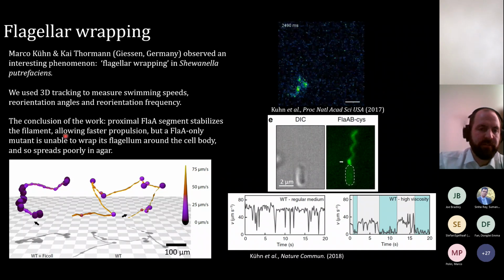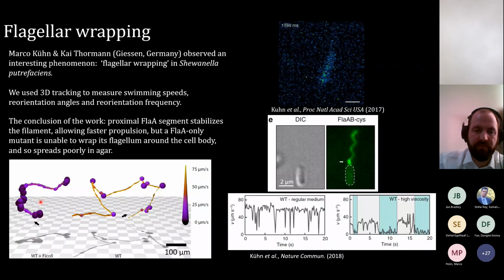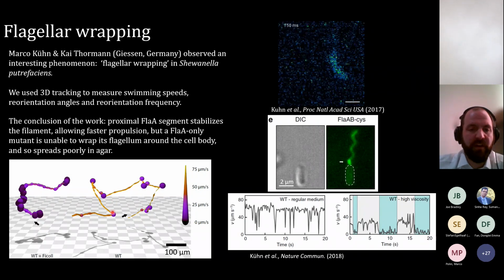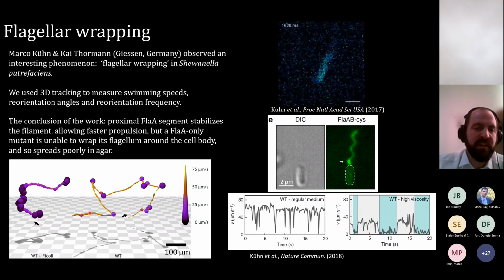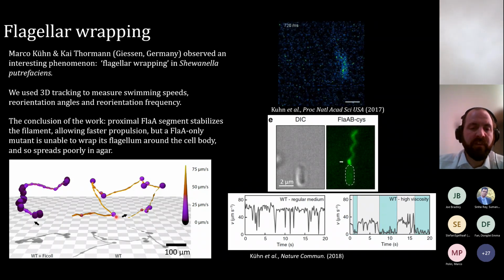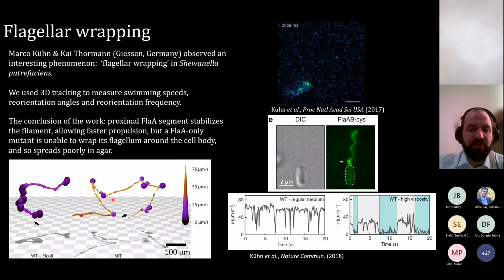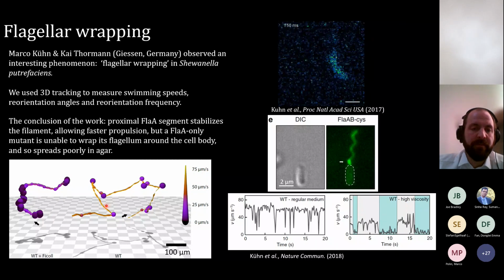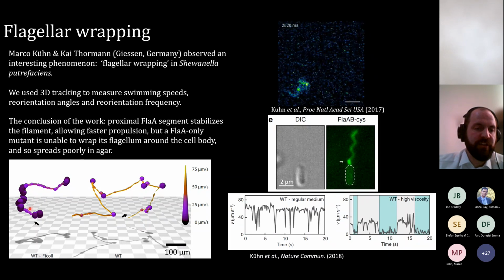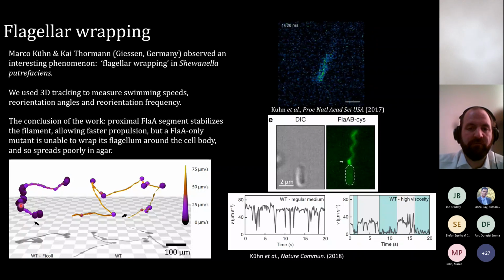And what you can see in the bottom left-hand corner of this slide are 2 tracks. So the kind of purple track, the bottom left-hand corner, is cells swimming in a fairly heavy viscous solution. It's a viscous environment. And on the right-hand side, we've got the cells swimming in a much lower viscosity environment. And I've got this kind of paintbrush style plot whereby when the cell moves fast, the lines are thin, and when the cell stops or reorients, the line becomes thick to indicate that the cell's speed is slow. So in this situation where you've got a water-like Newtonian physical environment, the cell swims fast, reorients, swims fast, reorients. In the presence of a viscous agent, the cell spends a long time swimming relatively slowly, and this is because we're able to trigger the cell flagella wrapping behavior.